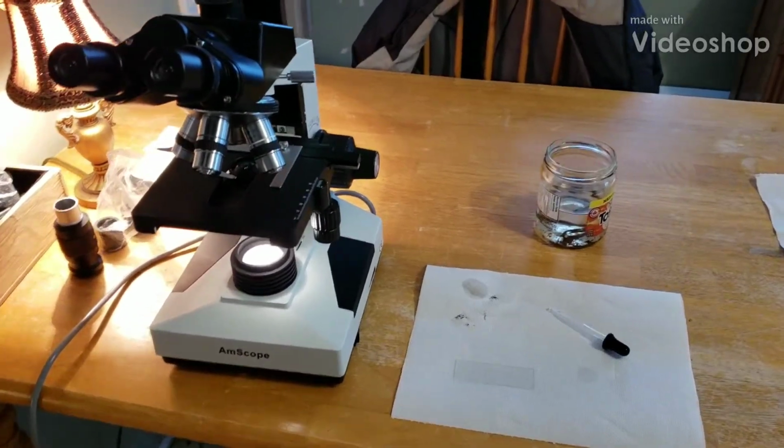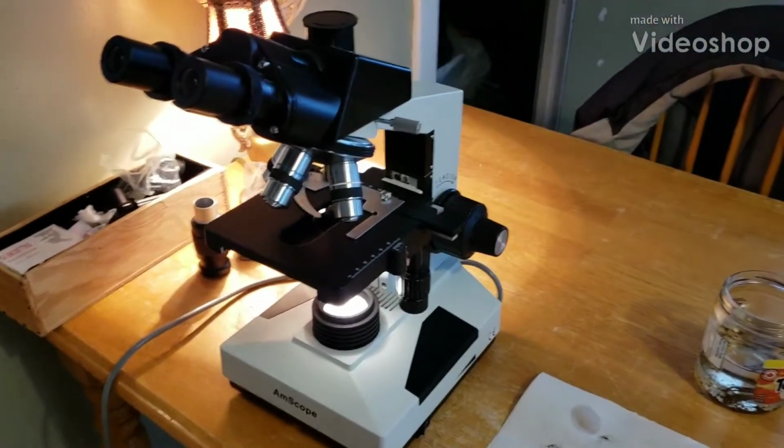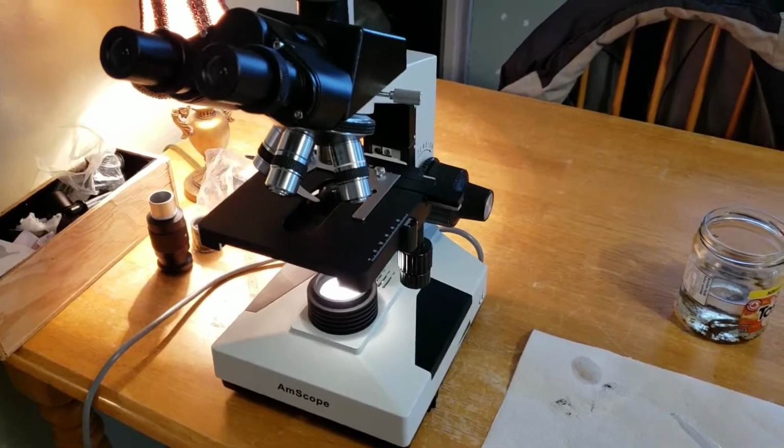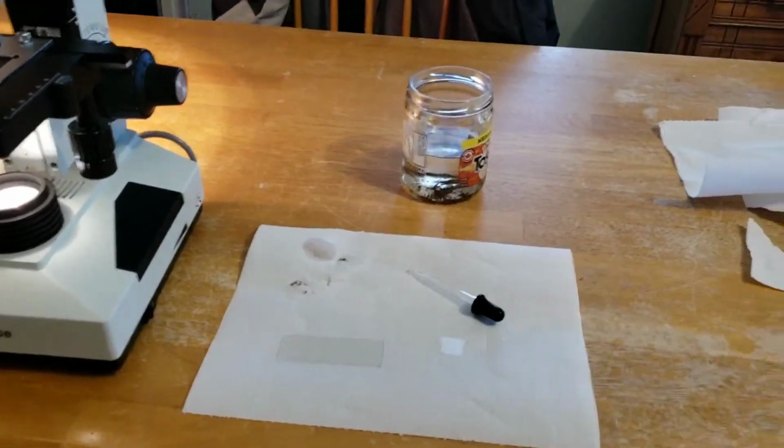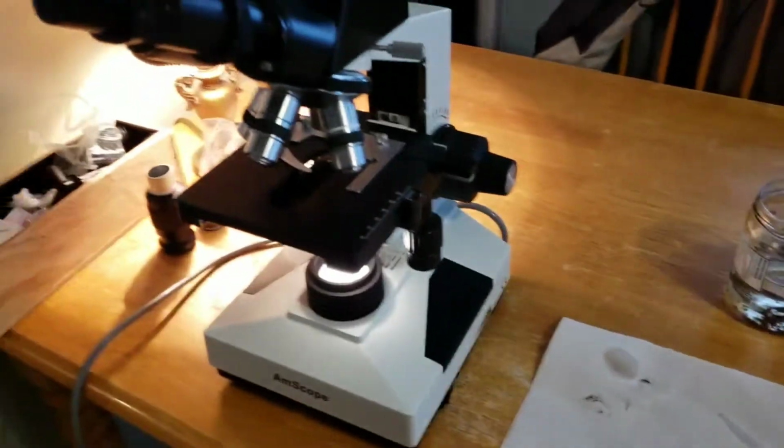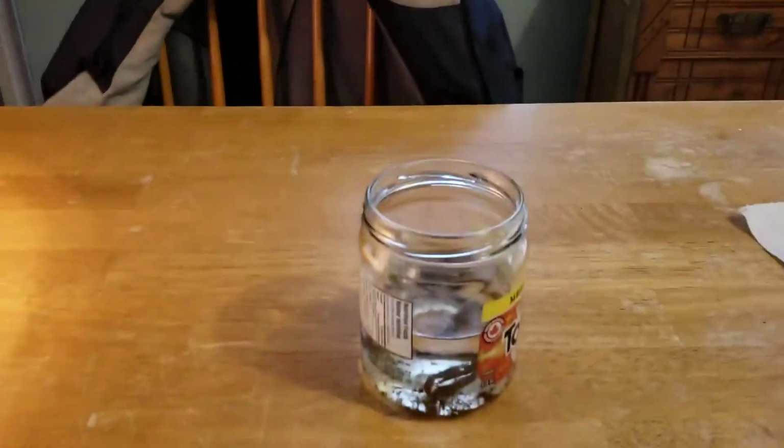Hey guys, what's up? I'm doing something a little different today, and I thought maybe some of you'd be interested in looking. I went up to the local pond just behind my house and got some pond water, a little bit of debris in there. And we're going to look at it under my microscope and see what little critters may be living in there.